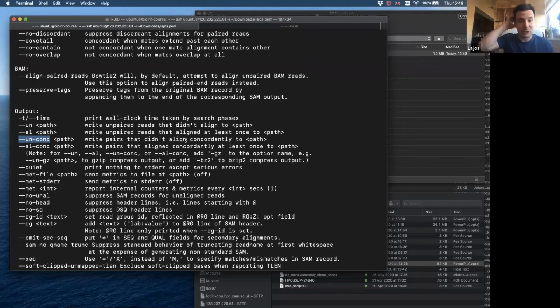That was the approach I told you should use, and this is what you may use if you want to assemble the genome that I will give you for the weekend. In that raw data you will have 2 different genomes, or 3. I think I will just give you the one with 2 different genomes, and you can use one of the genomes to do a Bowtie alignment and extract all the reads that are not aligning to that genome, because you actually want to de novo assemble the other genome.